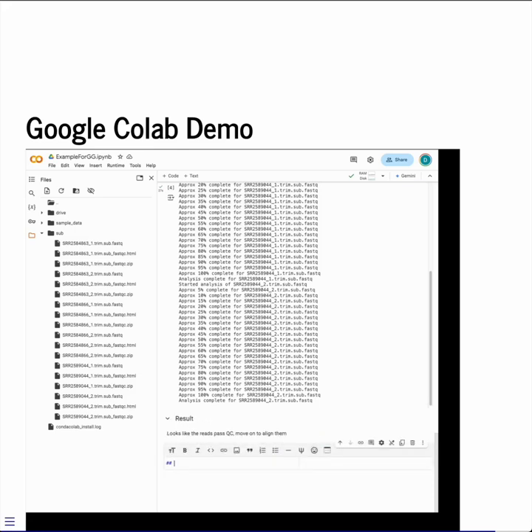So the next step is to record my plan for the next step, which is the alignment. And I intend to do that with BWA.